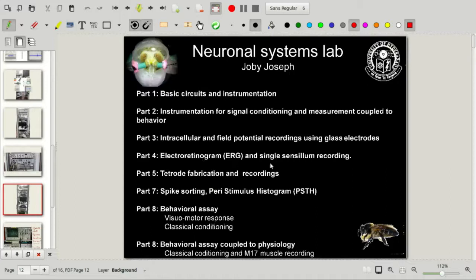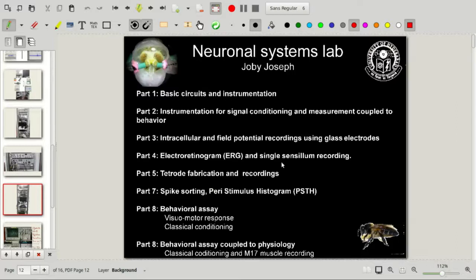One of the most common techniques in electrophysiology, which everybody can do easily, is the electroretinogram. Another is single-sensillum recording. Both of these are extracellular recordings. The electroretinogram is a large field recording where you measure the activity of many neurons from the retina — the retina is the eye that is visible from the outside, and in mammalian systems you place the electrode on its surface. Single-sensillum recording is a recording from the antenna — the olfactory sensory transduction point. The sensillum has many receptor neurons, and this enables you to record from them extracellularly, measuring action potentials generated in these sensory neurons.